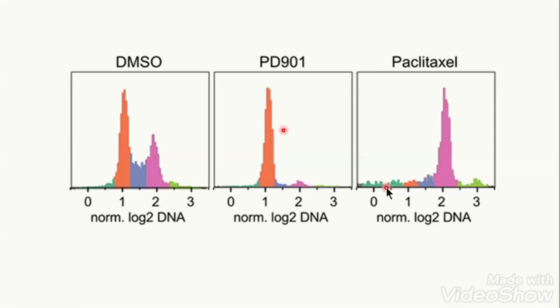And I personally believe that to get good results and amazing data out of any technology, data always comes in terms of absolute numbers. Quantifiable data is required. Because sometimes, if we are looking at microscopy to find whether something is killing the cells or not, you can make the system biased. System bias means you can focus your lens only on the area where you want to look. But if the software is doing the counting for you, then you cannot be biased about your own experiment. And you can analyze the data in the most quantifiable way possible.